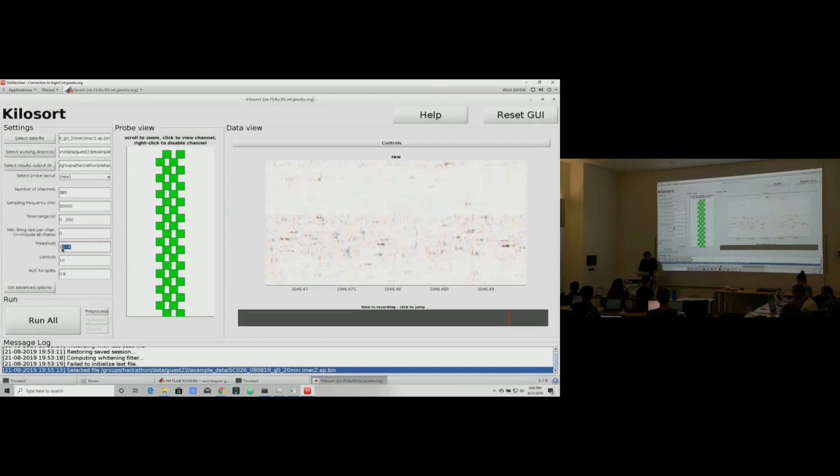So these are the 2 thresholds. These are actually now the 3 parameters for the actual algorithm, the 3 that I described at the end of the talk. The first one is the threshold for the optimization pass, the forward pass. The second one is the threshold on the extraction pass, which is much lower, just to make sure we grab everything, because we want to set an adaptive threshold for each neuron. So we must first make sure we have more spikes than we need to cut out, however many of them we want to.